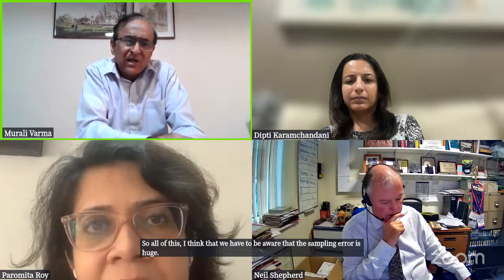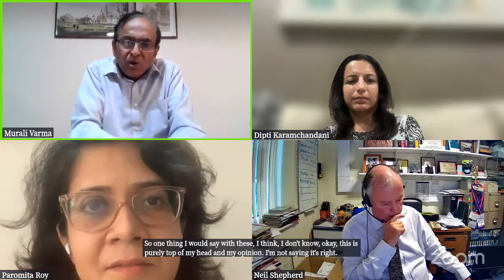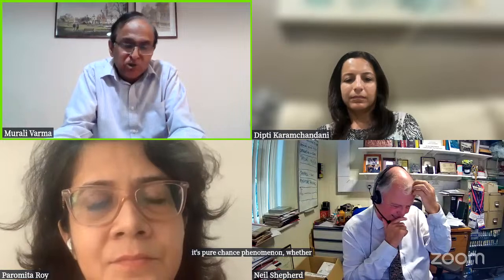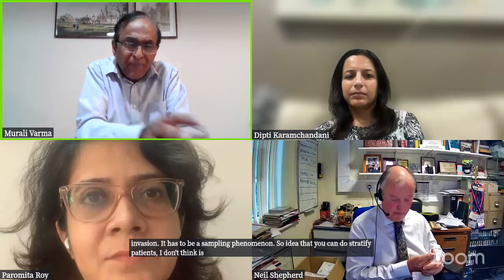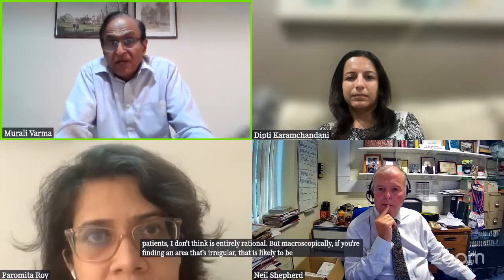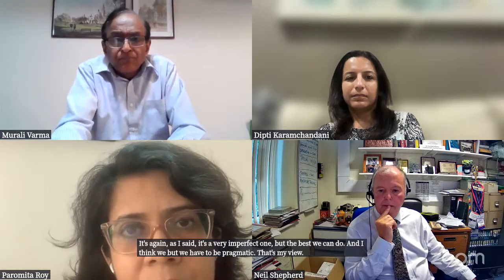So one thing I would say, and this is purely off the top of my head and my opinion, I'm not saying it's right: whether you find microscopic extracapsular invasion is a toss of a coin. It's a pure chance phenomenon, a sampling phenomenon. And so the idea that you can risk stratify patients, I don't think is entirely rational. But macroscopically, if you're finding an area that's irregular, that is likely to be extracapsular, yes, that would be worth sampling. It's, as I said, a very imperfect approach, but the best we can do. And I think we have to be pragmatic. That's my view. Okay, Brendan, and then Dipti.